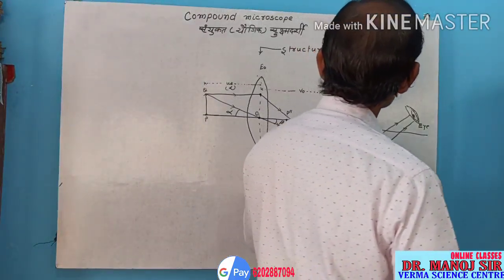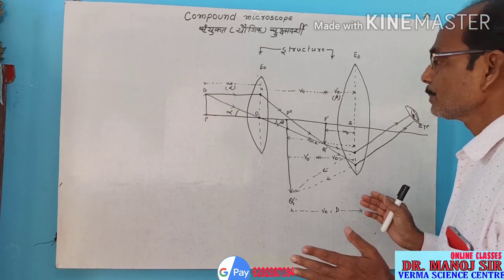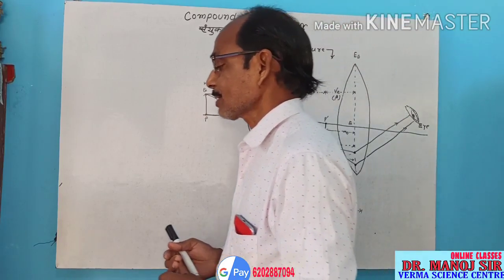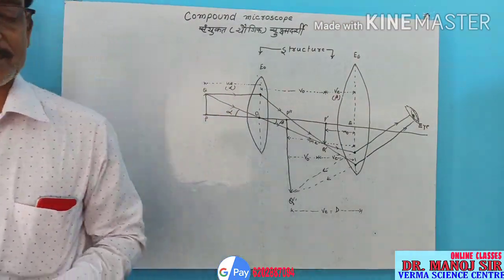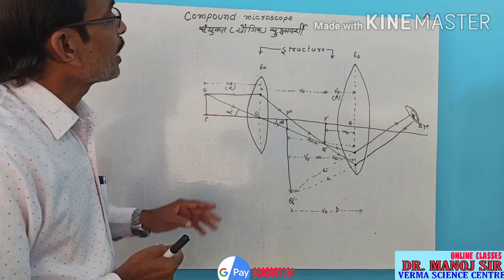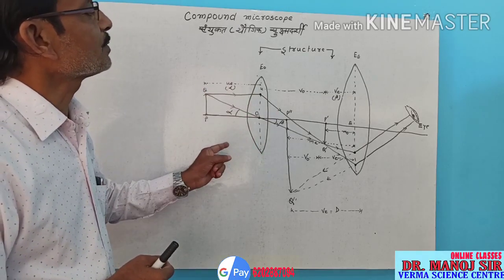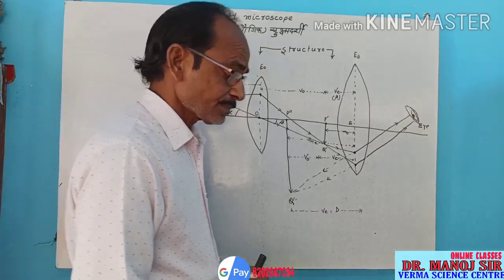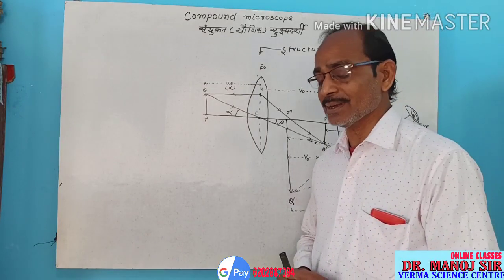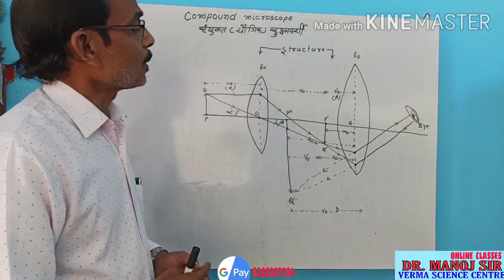It is also used in laboratory for practical purpose to detecting microbes as bacteria or virus, and also applicable in the examine of urine culture, stool testing, blood testing, coughing and so on.